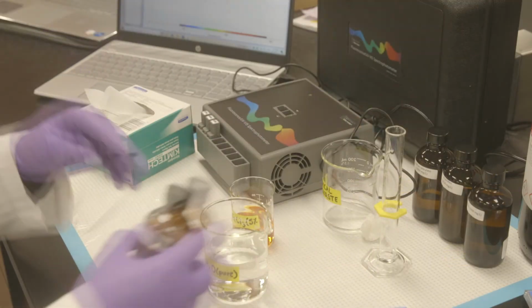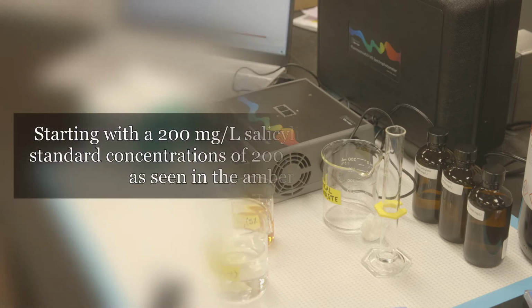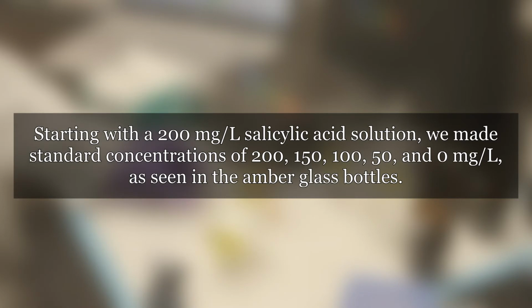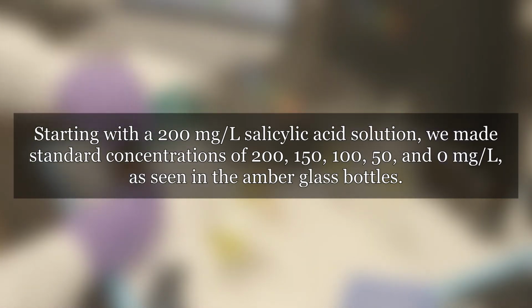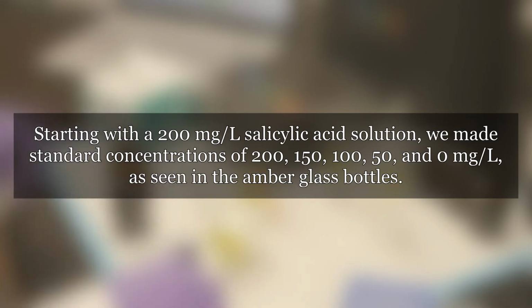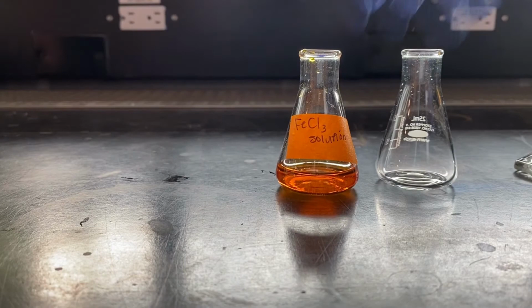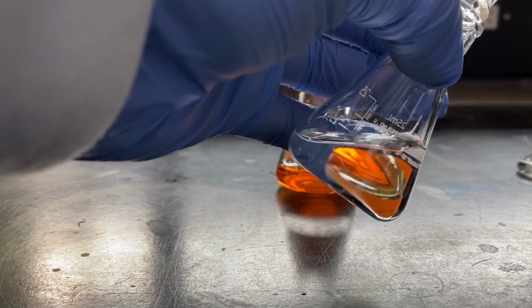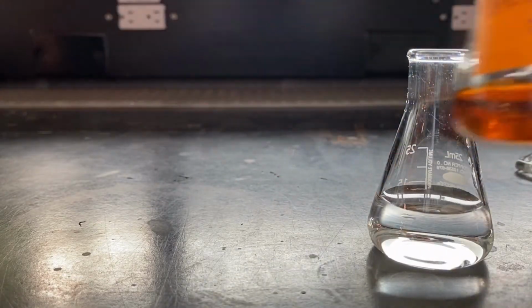To begin making the standard solutions, we will need to perform a series of dilutions. Starting with a 200 mg per liter salicylic acid solution, we made standard concentrations of 200, 150, 100, 50, and 0 mg per liter, as seen in the amber glass bottles. Ensuring that it has been rinsed since standard preparation, use the 25 ml graduated cylinder to measure 3 ml of each standard solution with 12 ml of 5% iron(III) chloride into each beaker.